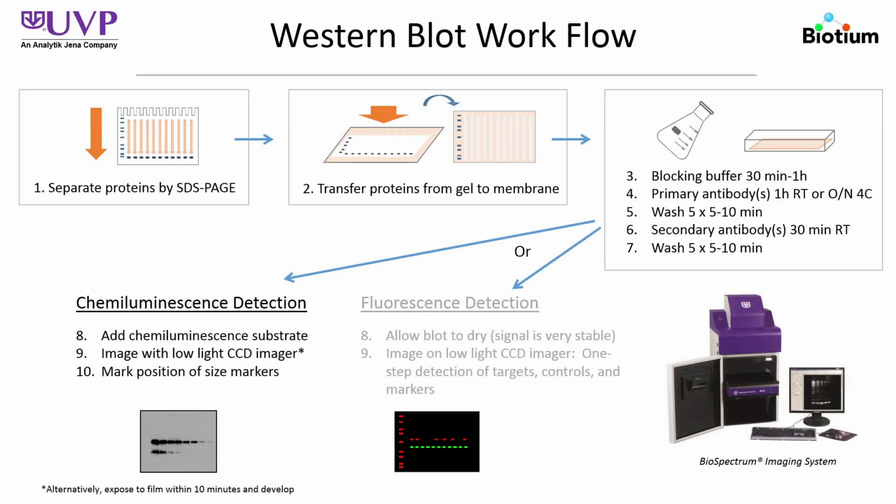See, during electrophoresis the proteins get separated, but there's no way for the antibodies or visualization reagents to make their way into the gel. They can't diffuse in readily. Once the proteins have been transferred onto this nitrocellulose or PVDF membrane, it makes it very easy to apply reagents, wash them, and identify the protein without any restrictions from the gel.